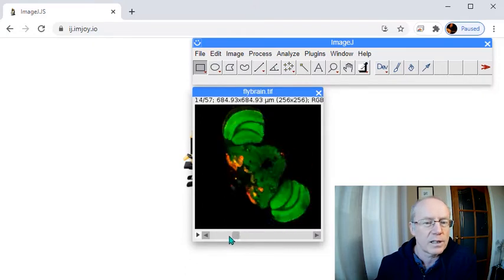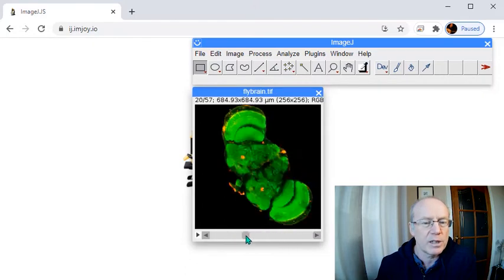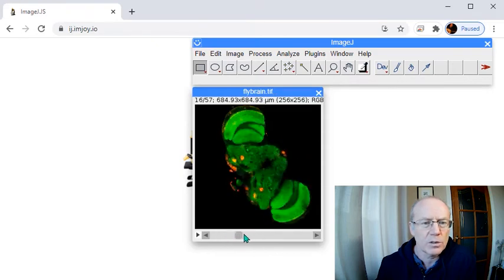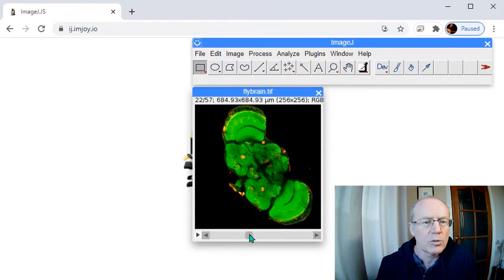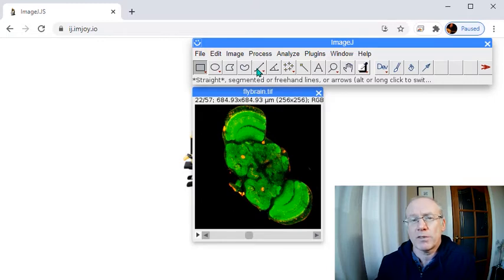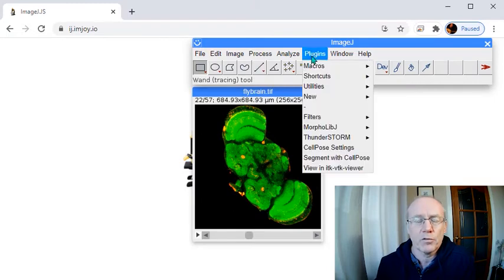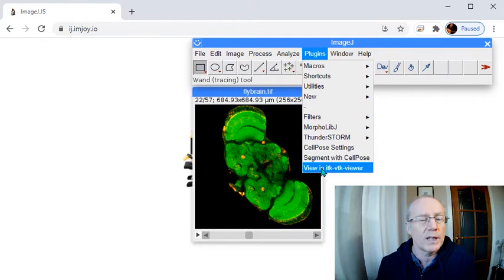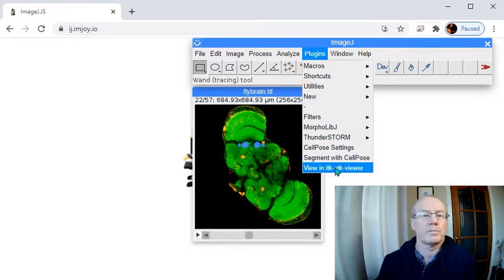Got a nice fly brain there. Kind of looks a bit saturated but hey that's not the point of what we're about today. I mentioned I couldn't find the plugin for 3D. The plugin for 3D is quite simply view in ITK VTK viewer.